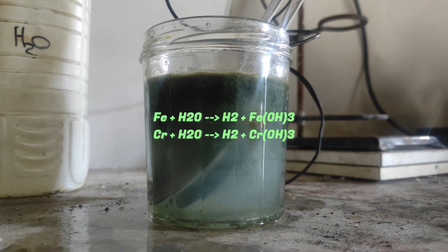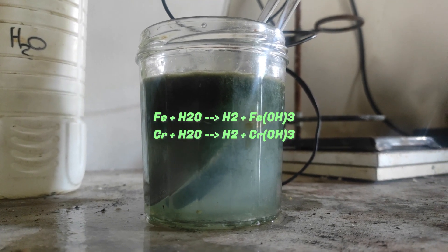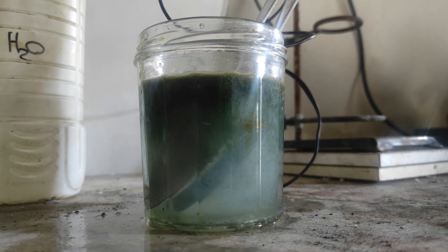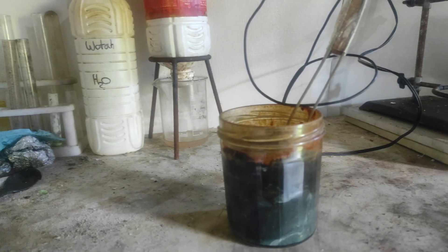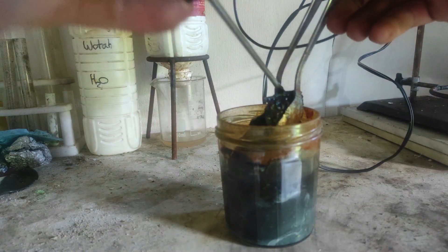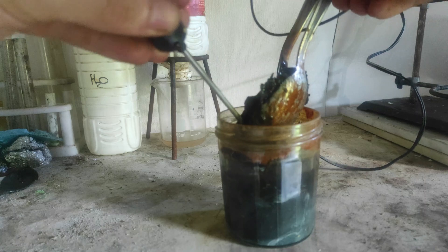The iron and chromium alloy gets converted into their respective hydroxides as hydrogen gas gets released. We can see the formation of a dark green-brown sludge, which is our product. You may need to alternate the electrodes so that their corrosion stays the same.